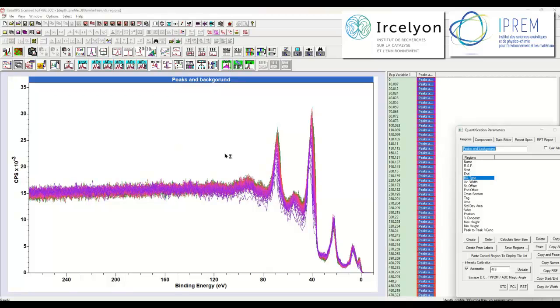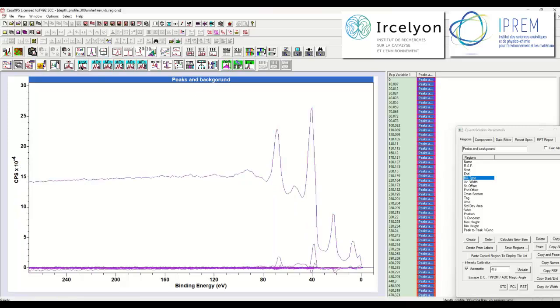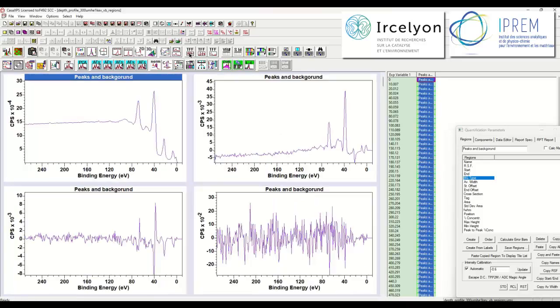Now that I have the data that's just focused on the interval that I'm interested in, I can try the PCA again, and let's have a look at what happens now. Before, when I applied PCA to the full survey measurement, I ended up with 4 abstract factors that had shapes that might be related to the signal, and now I have 3.